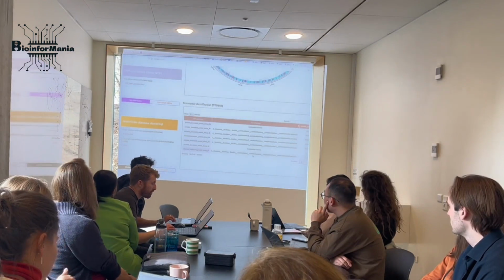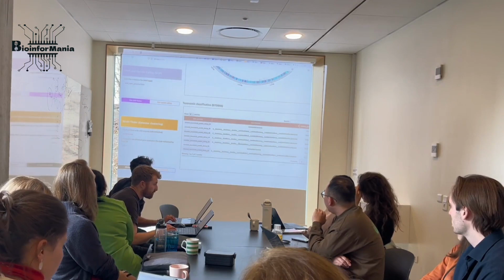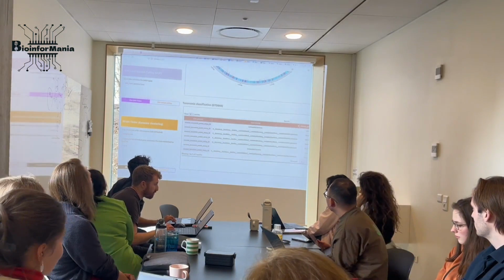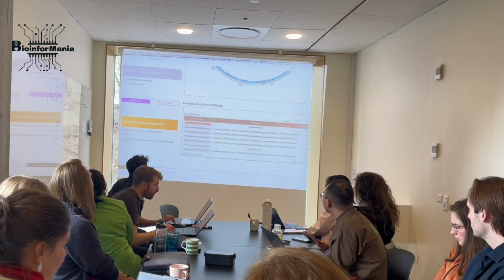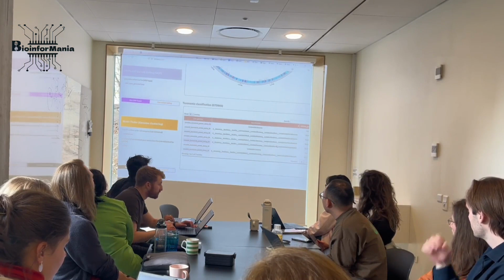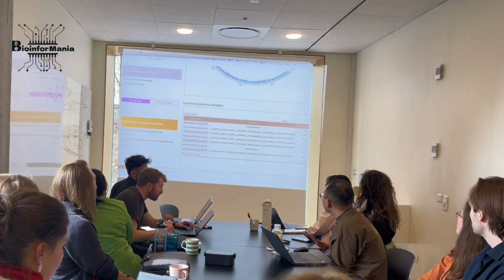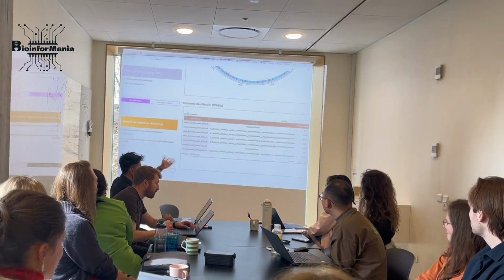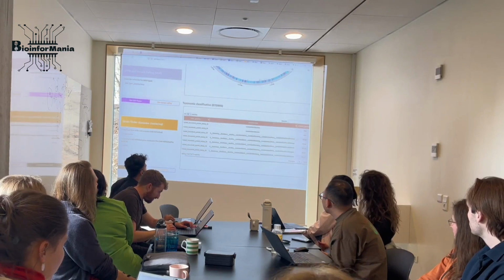But while that one is thinking, this is a cool example of if you had a taxonomy classification table, it's unparsed. You remember we talked about parsed and unparsed? It's telling me that barcode 18 is unclassified, barcodes 19 until 22 are well classified up to species level, and this is the average proportion of identity to the reference genome to which these have been assigned. Okay, so they have it better, obviously. It's quite a responsive table. You can also do selections and stuff.